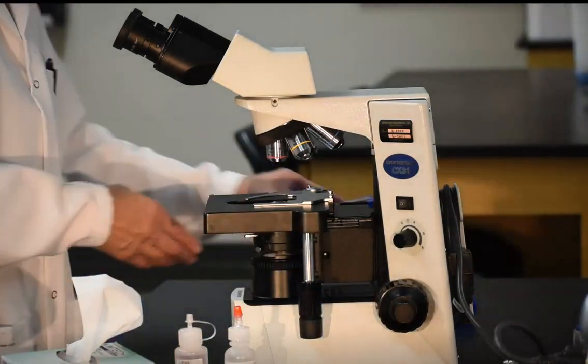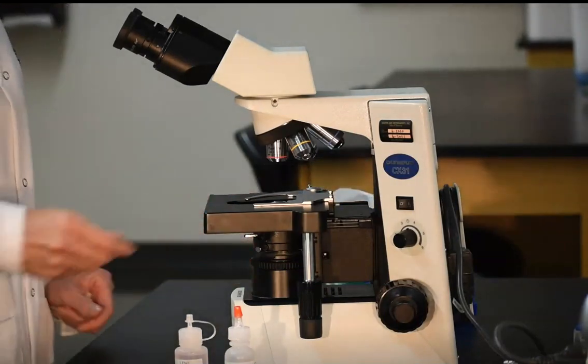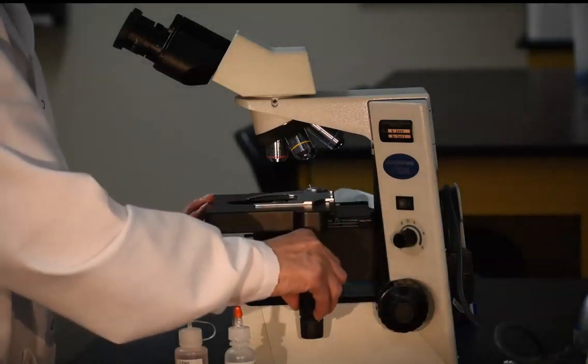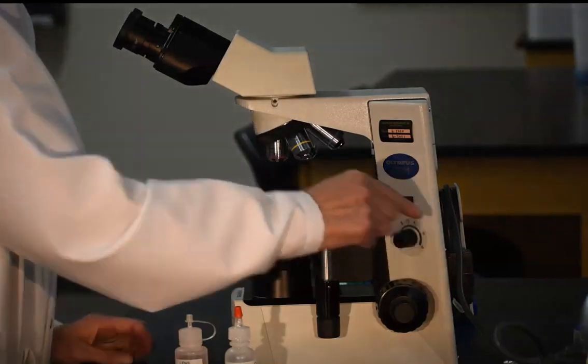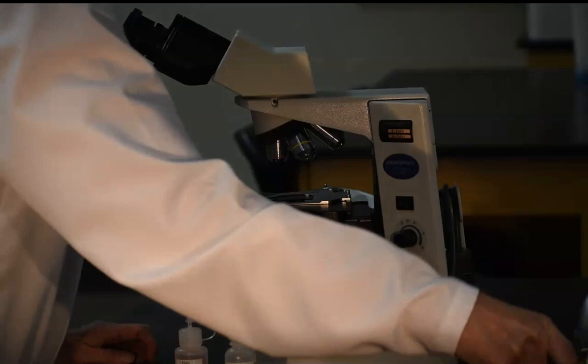To store the microscope, be sure the stage is lowered and it's not jutting forward. Turn the light intensity down, and of course the power should be off. Wrap the cord around the microscope.